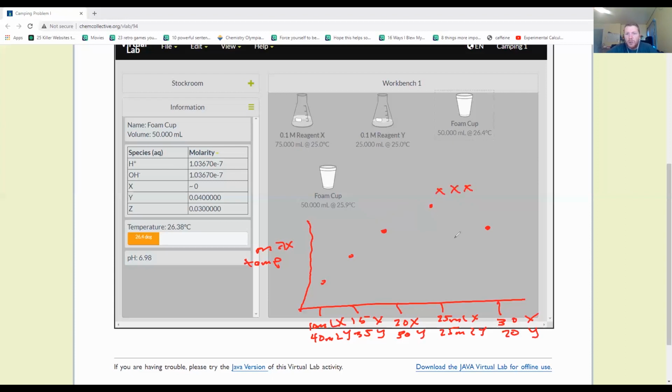So basically between these two data points. And if you do that, you're fine-tuning to figure out what is the optimal and the maximum temperature that you can possibly observe. Okay, so that's all there is to this experiment and to this exercise. You'll have to do a total of 8 trials. 4 of them are prescribed. 4 more of them you'll have to determine yourself.